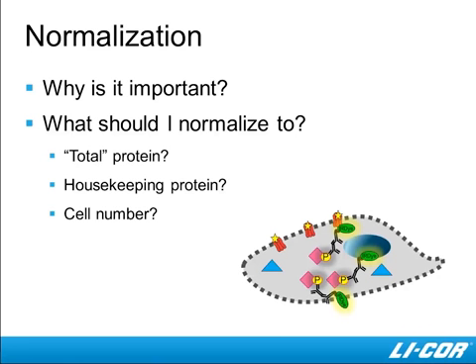If I don't have a total protein antibody, perhaps I want to choose a primary antibody against GAPDH or actin or another housekeeping protein. Now, these first two options require the use of primary antibodies and secondary antibodies, typically which can be quite costly. And additionally, if you need to optimize these conditions, it can take a lot of time away from other experiments.